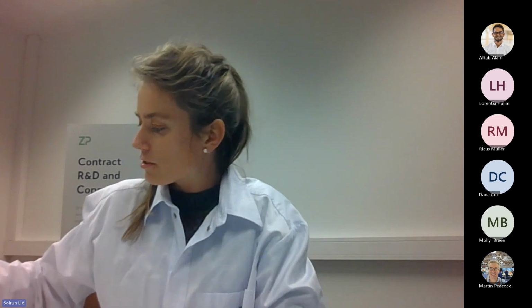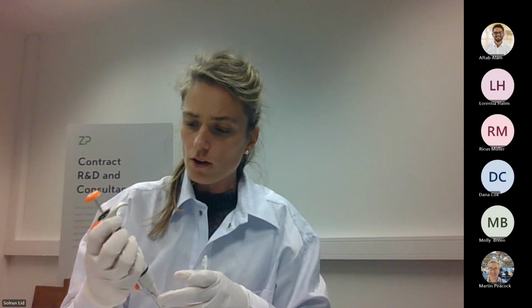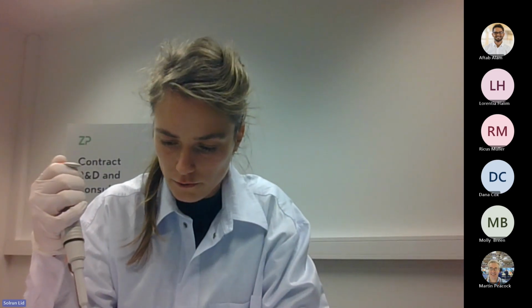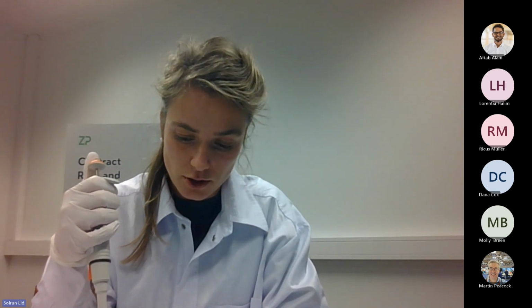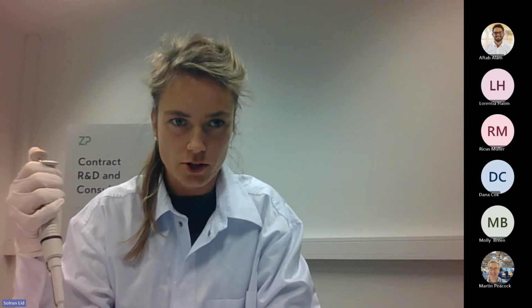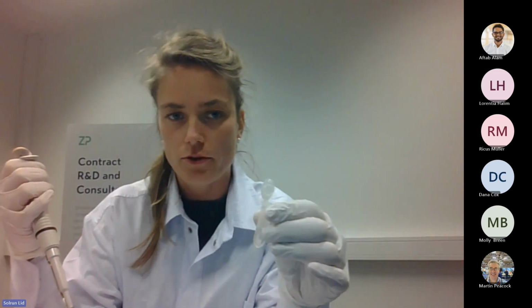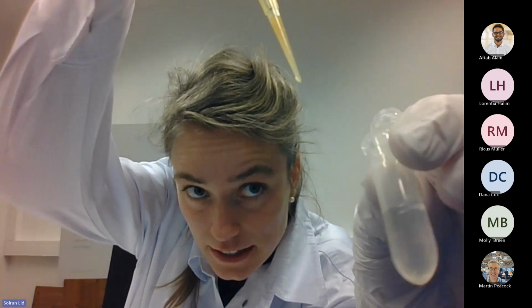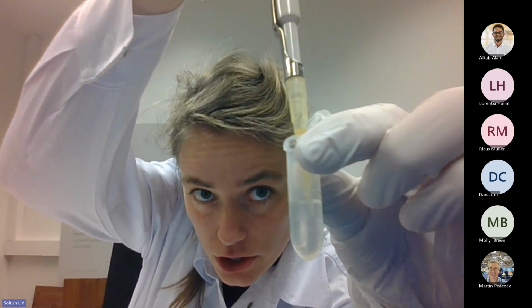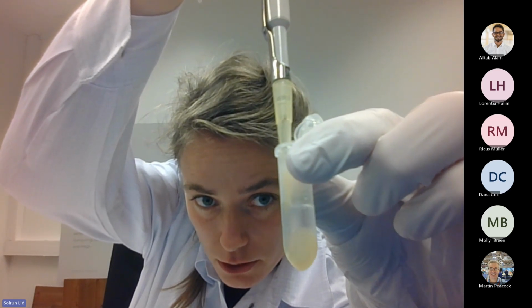So we vary the mixture ratios that we use, and the mixture ratio depends on the pungency of the solution you're testing. So let's say you were testing a very spicy solution, you would use a higher mixture ratio. And this is in order for us to get to that range where it's most ideal for testing. So here I'll just add the ginger shot into the solution.